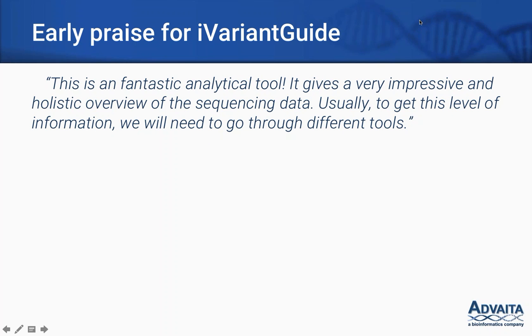Some of our earliest users have said very complimentary things about iVariantGuide. They often mention how comprehensive the application is, providing multiple analyses in a single tool. They mentioned the time savings this brings by not having to import data into multiple tools.